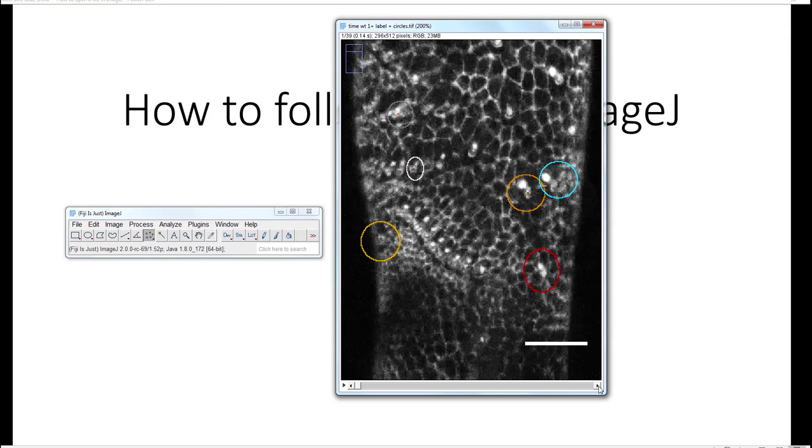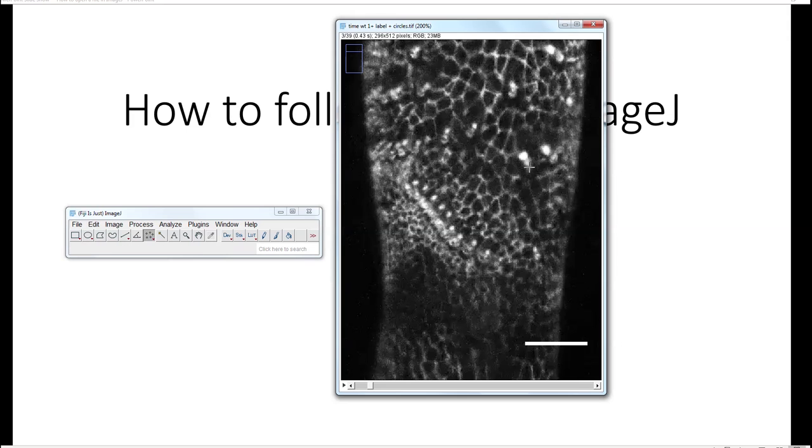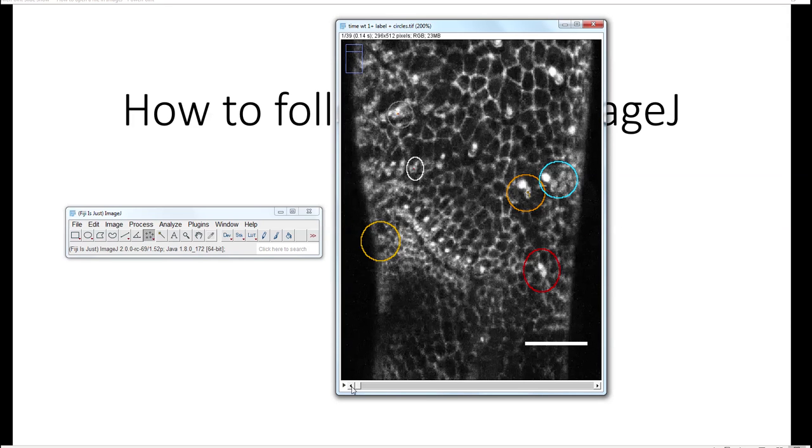Be careful: you don't move your cursor to the right or to the left, because you will move the dot. Look, if you press the cursor up or down, it will move. So you can put it back here, but here you can left click and you have the second one. Here you left click to the next part, and you try to look where the next one is, and again left click. If you see here there is a 3, before there is a 2, and here is supposed to be a 1. And in that way you can continue to measure the whole movie.